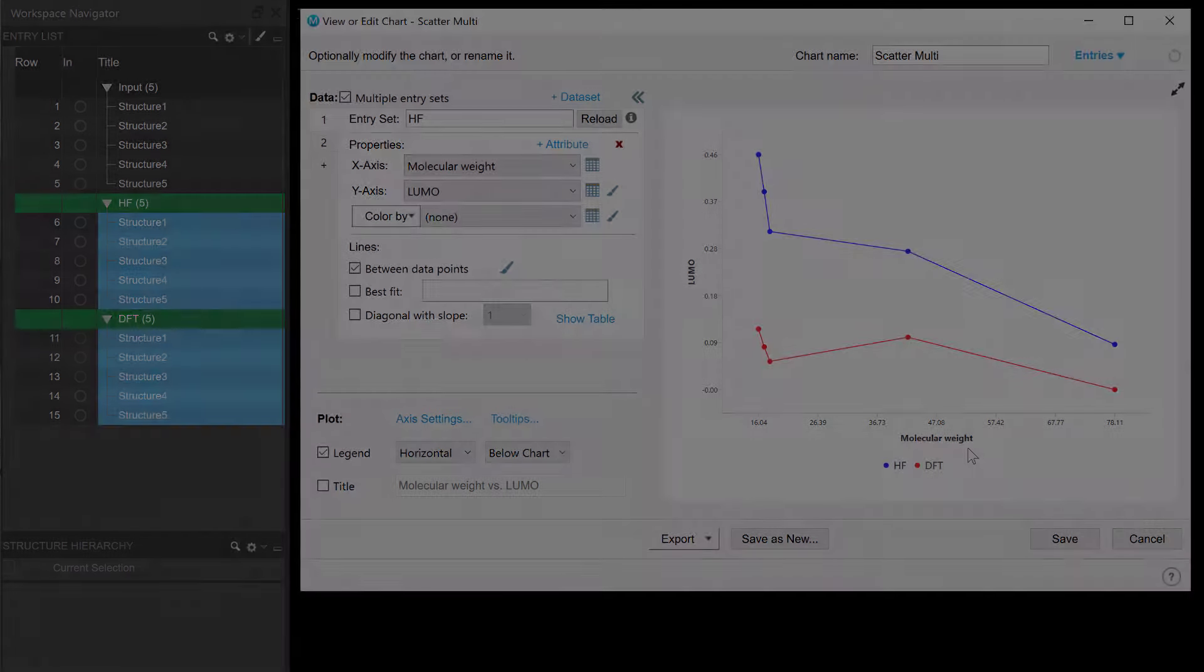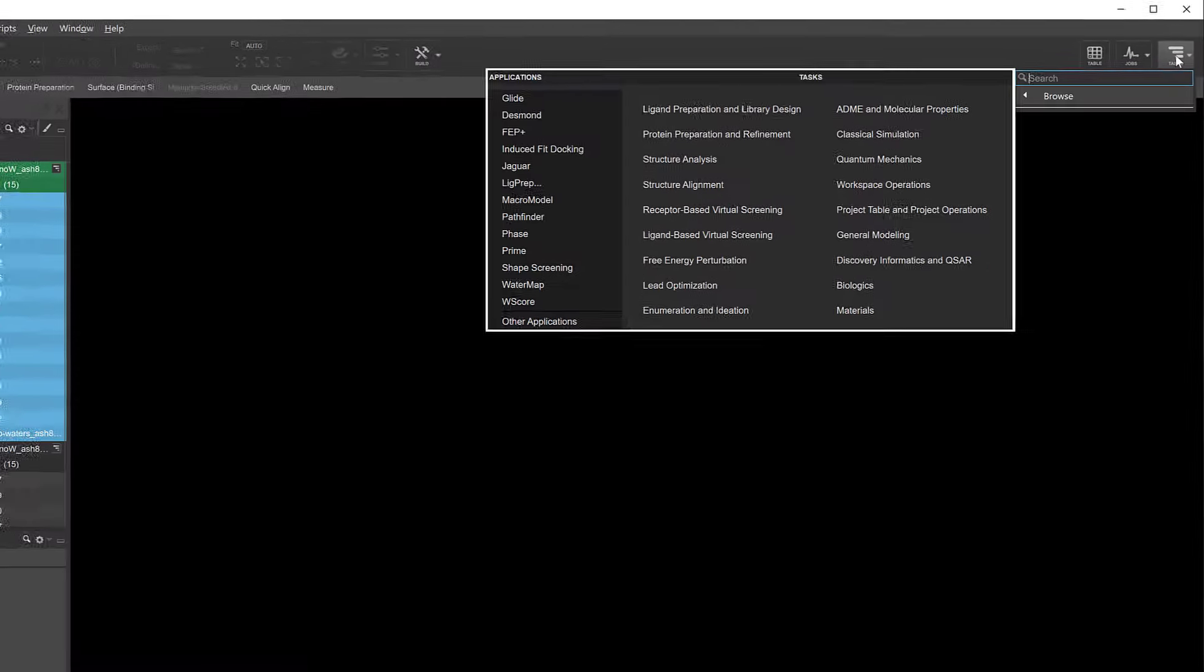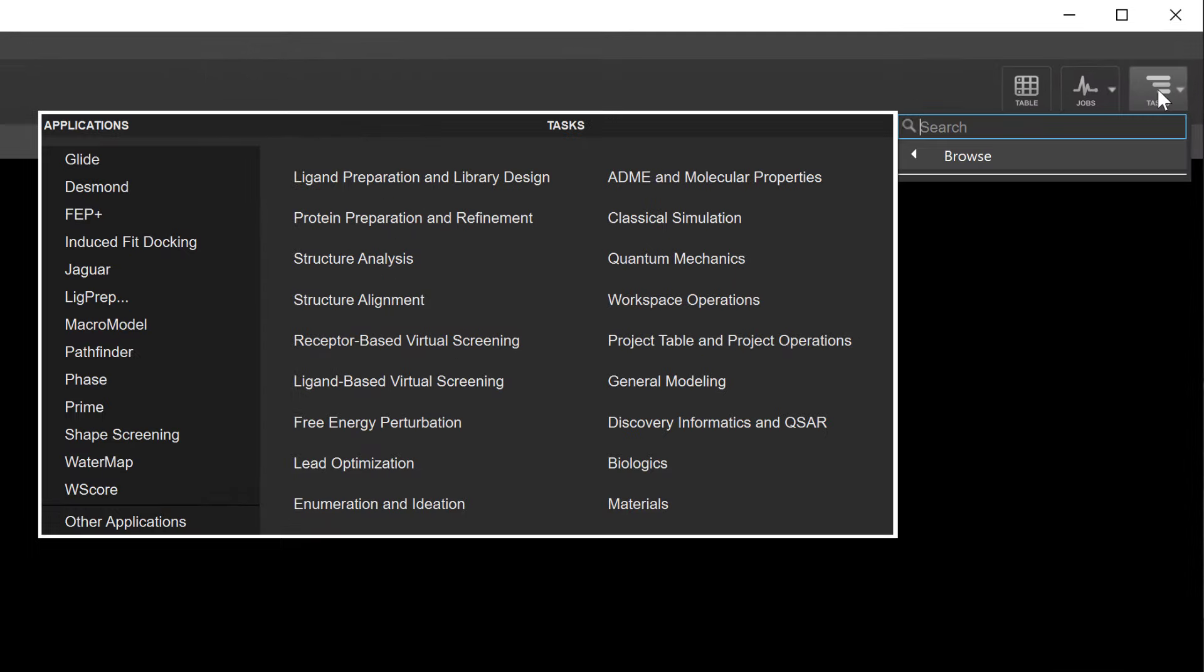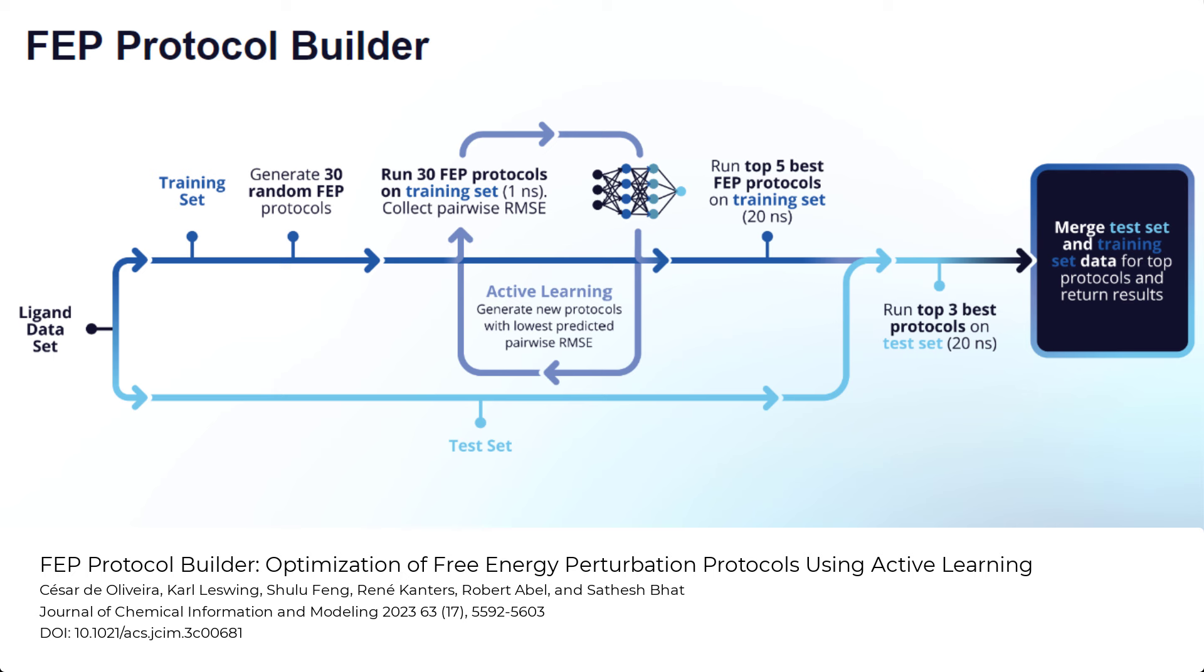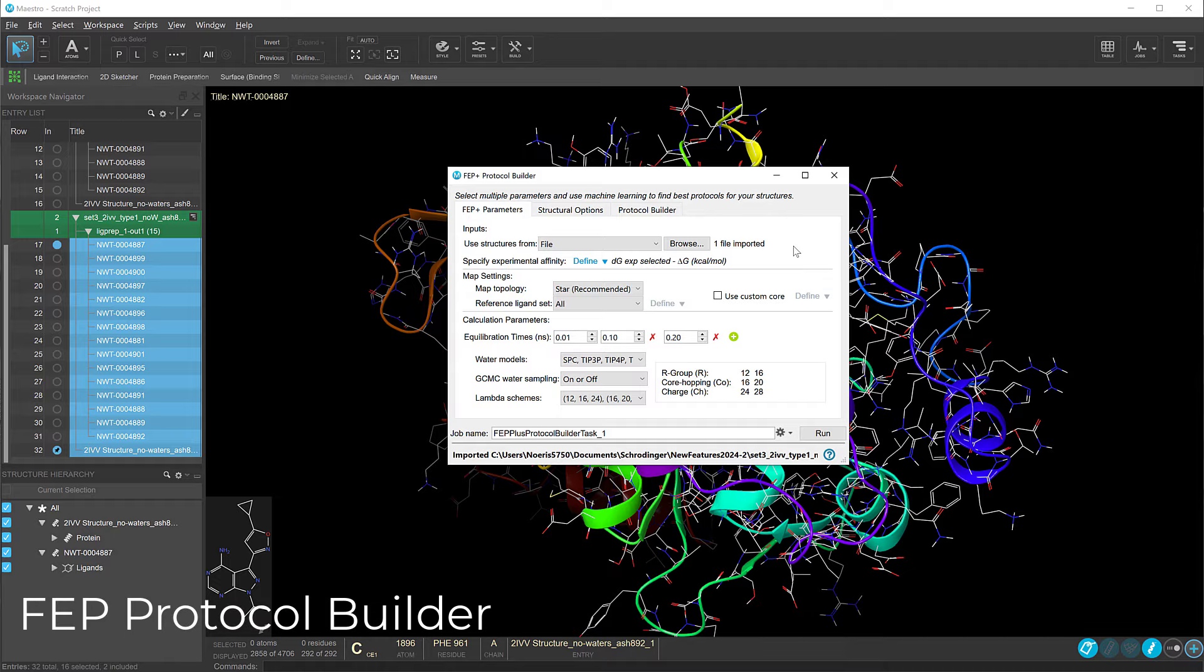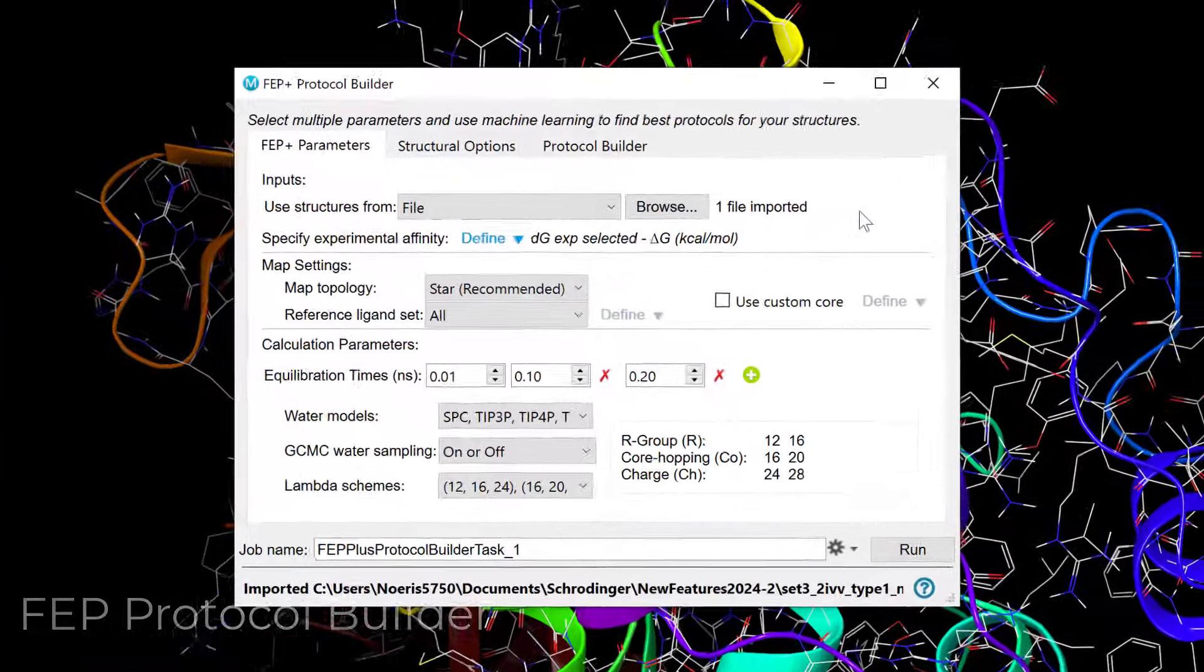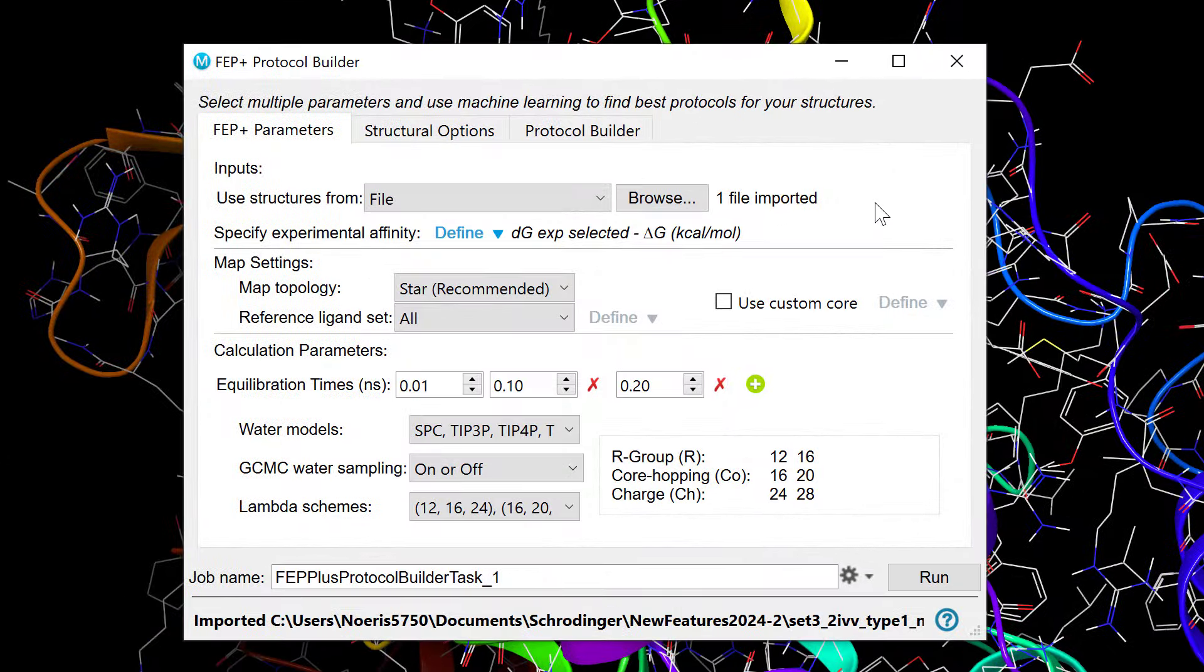Moving on to the application panels, the 2024-2 release unveils the FEP Protocol Builder. A powerful new workflow designed to streamline the process of identifying FEP plus model parameters using advanced machine learning techniques. Ideal for situations where the default FEP plus protocol may be suboptimal. With the FEP protocol builder, users can now explore a wide range of FEP plus parameters.